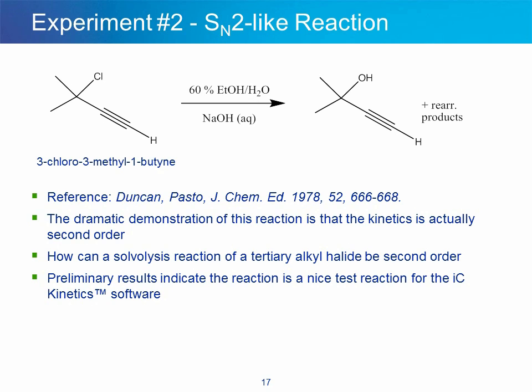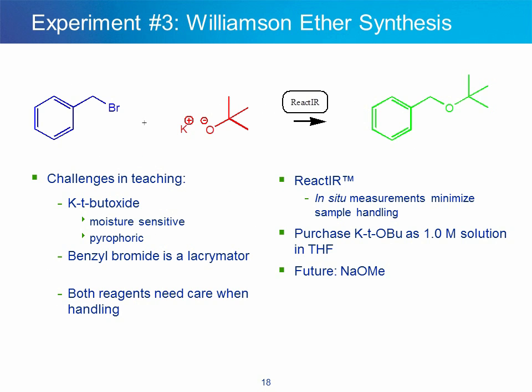How can a solvolysis reaction of a tertiary alkyl halide be second order? Preliminary results indicate that this reaction is a nice test for using the IC Kinetic software. The next reaction that I would like to describe is the Williamson ether synthesis.